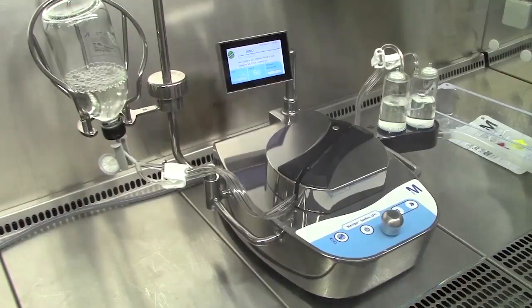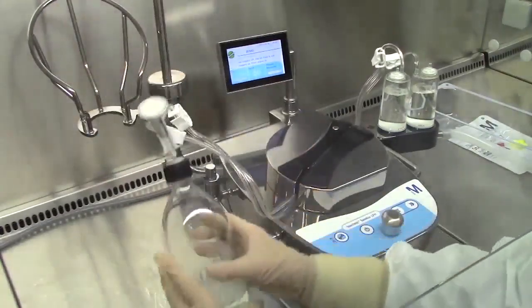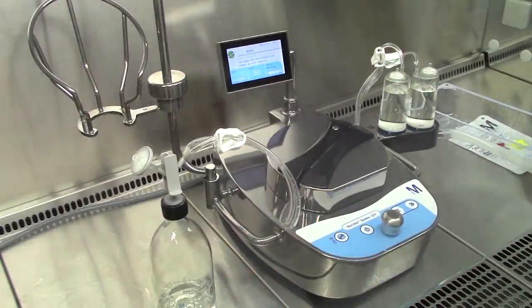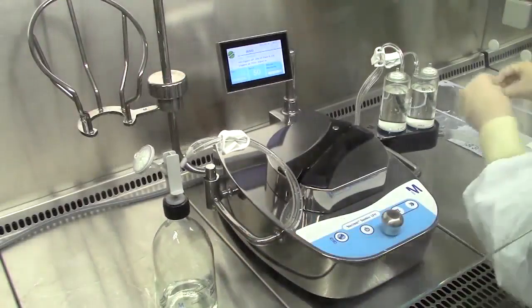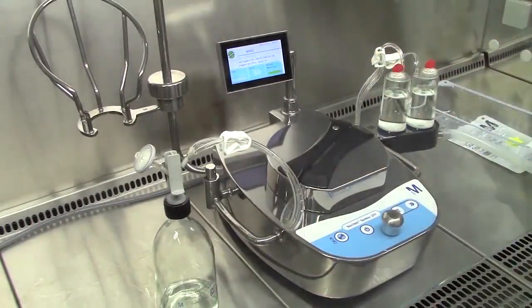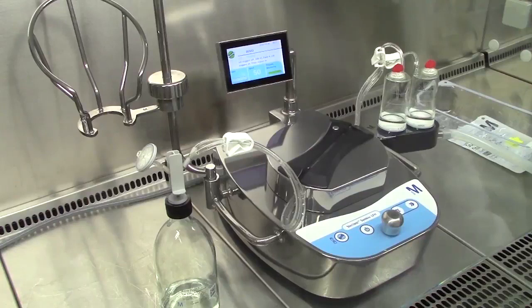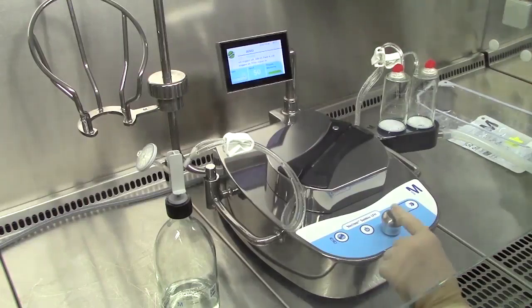Ensure that the fluid does not splash up near the top of the canister. This can block the vent filter and prevent the canister from venting. When the rinse liquid reaches the upper line, place a red plug onto each of the canister's air vents. Allow the rinse fluid to filter entirely through the membrane. Stop the pump.